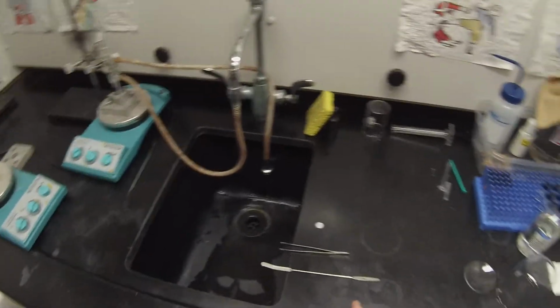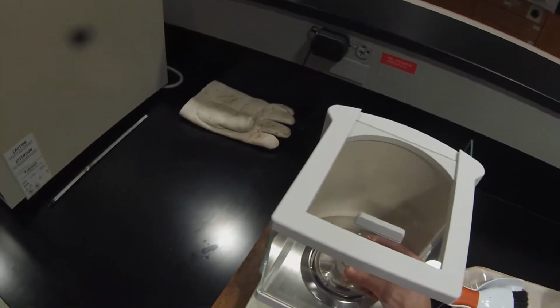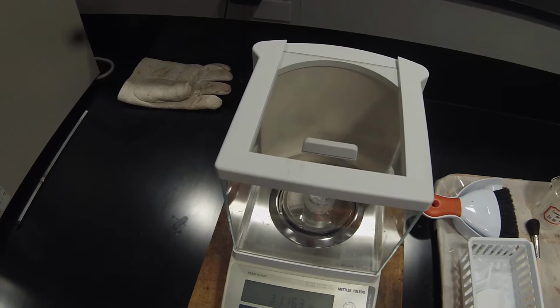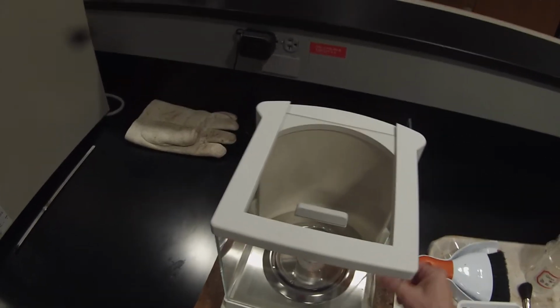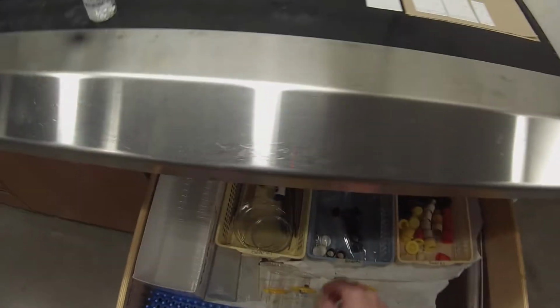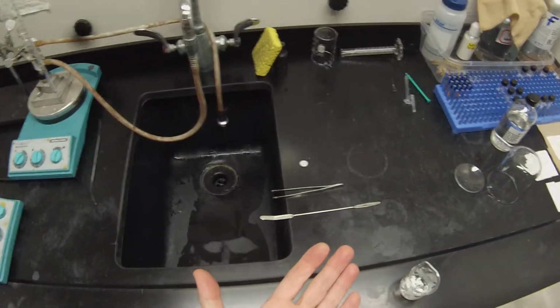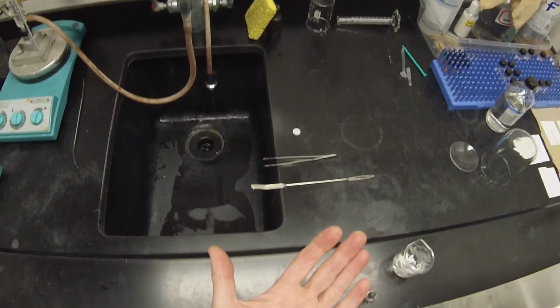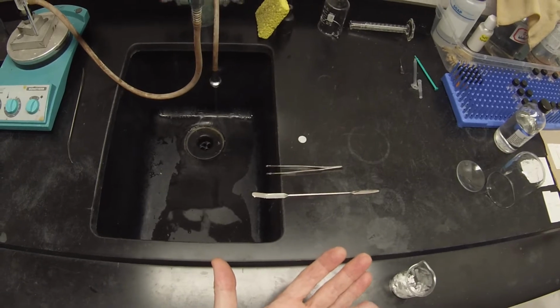So we do want to keep a little bit aside because we're going to want to get a crude mass spec. I'm going to go weigh this. So the mass of the beaker now with the solid in it is 31.164 grams. I'm going to add a boiling stone to that so that when I start adding the solvent for the recrystallization, that doesn't bump. A nice large boiling stone. Looks like a good one. Maybe I'll stick 2 in there just to be safe.